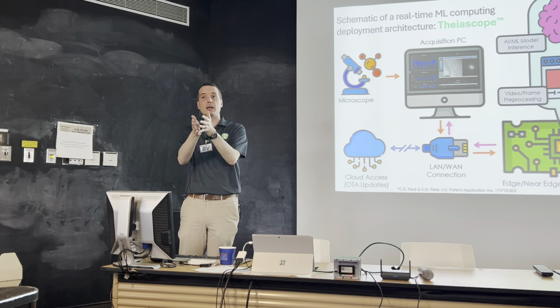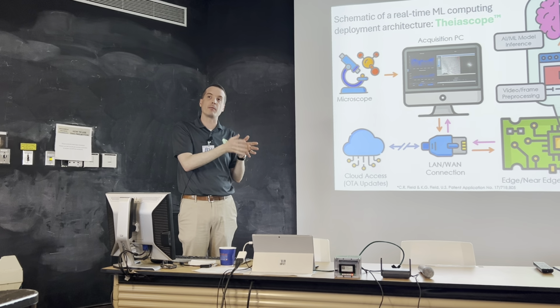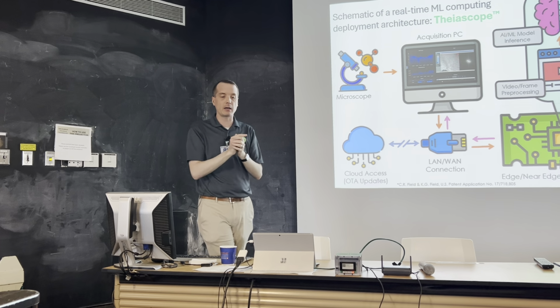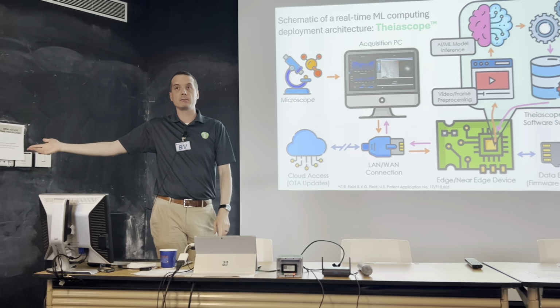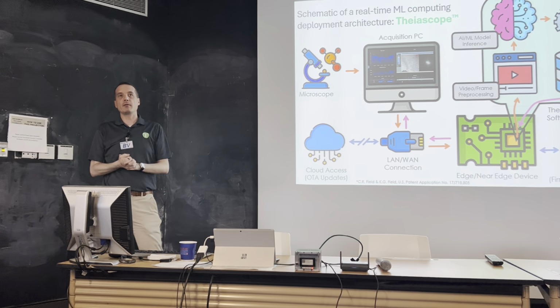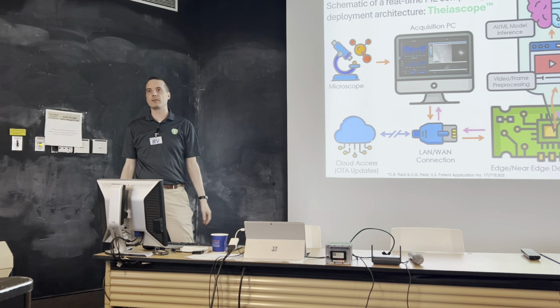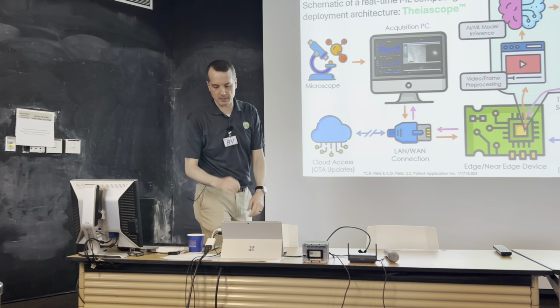So they would do the pruning from that standpoint. And then what we would be is the target platform for deploying the model. And they can just say, oh, well, we'll just prune it if we want it to fit on there. But we've actually got it so they can work on the edge computing device or just a standard data center grade GPU if you wanted to. Because one of the things that we've learned is that every microscope has a rack, so you can put your own rack server in there and have, we've done 11 GPUs at the microscope, which we'll get into.